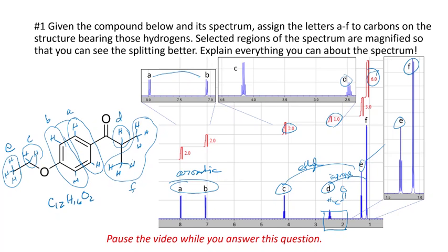All the chemical shifts are what we expect. We have the aromatic region. We have the region where there's some oxygen and the hydrogen is on the carbon next to the oxygen. We have this carbonyl group, hydrogen next to that, and we have a couple of alkyl groups which are not actually attached to any functional group directly. They're attached to other carbons that are attached to the functional groups. Well, how'd you do?